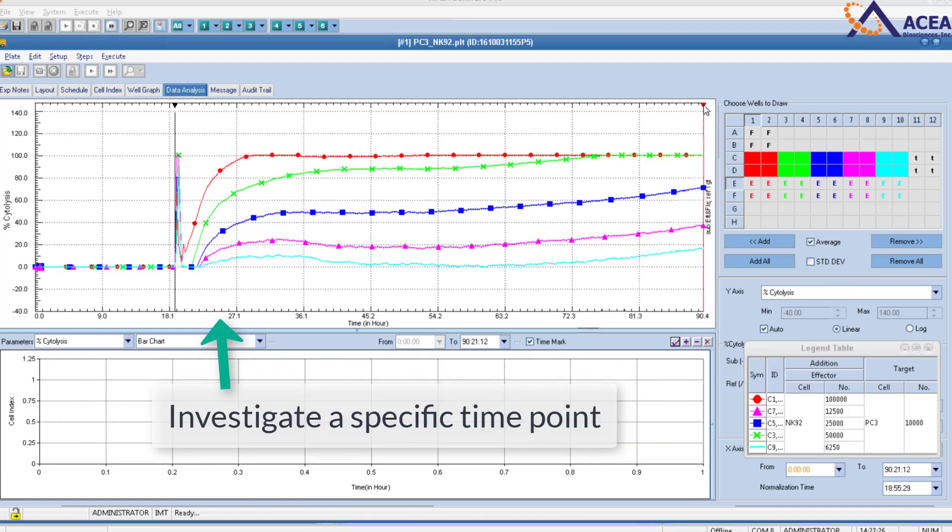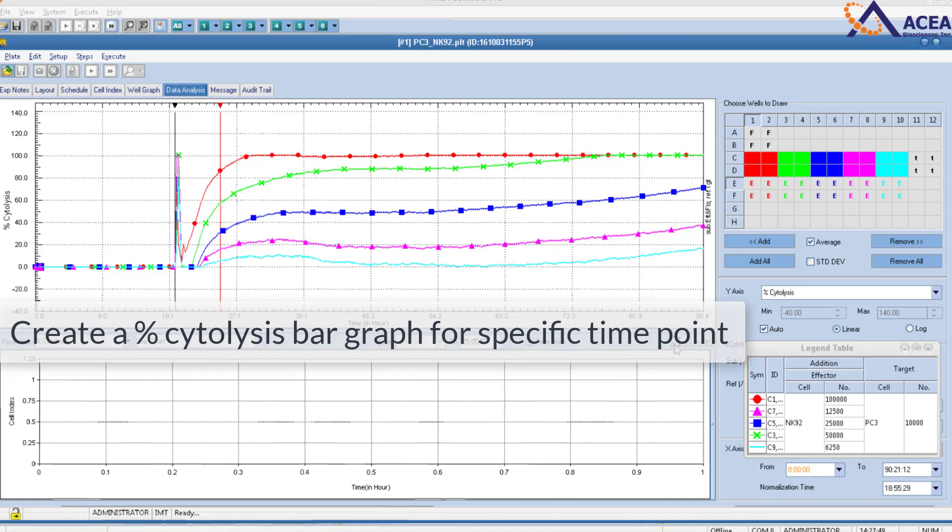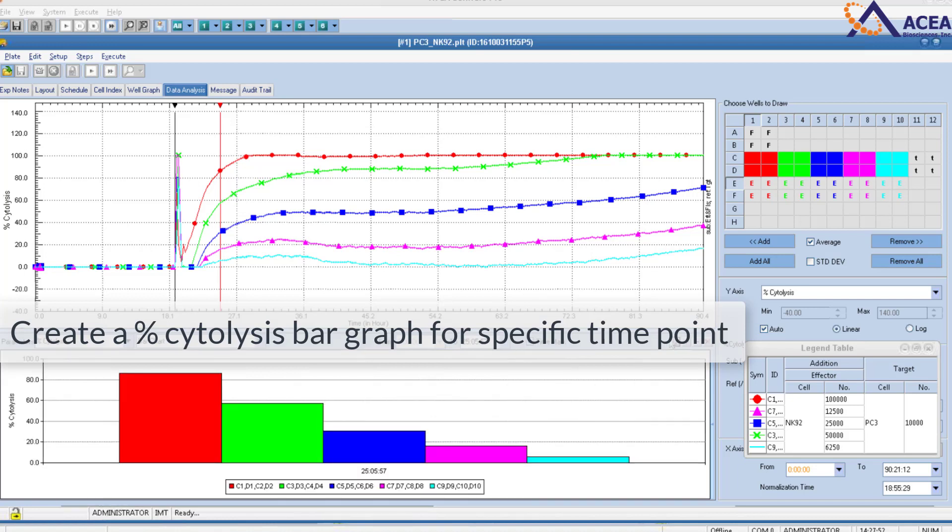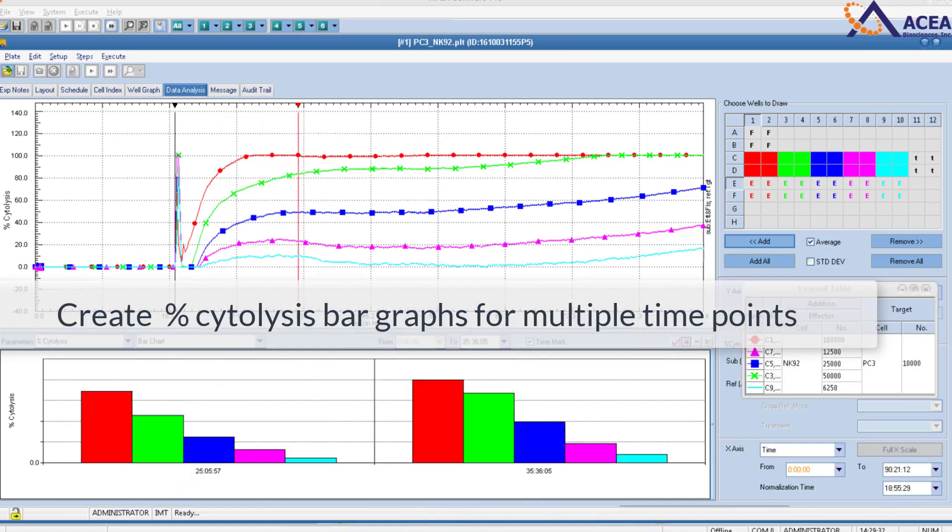With RTCA Software Pro, you can investigate a specific time point and create a percent cytolysis bar graph for that specific time point. You can also create percent cytolysis bar graphs for multiple time points.